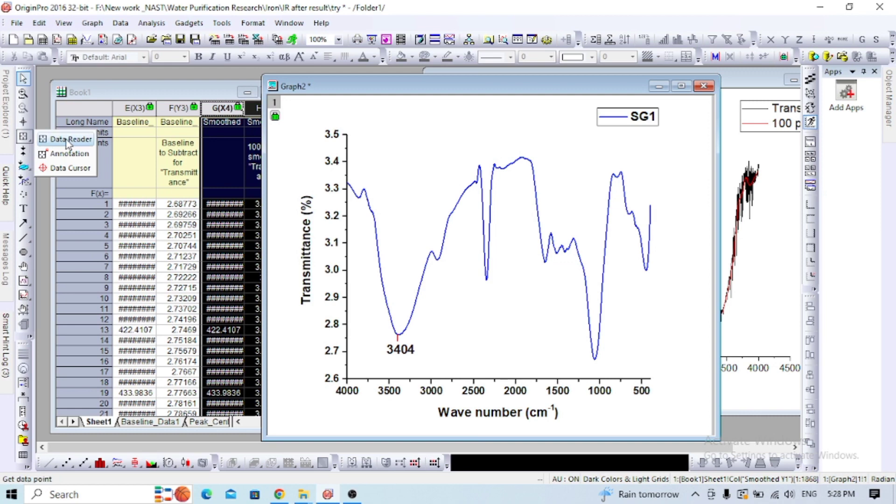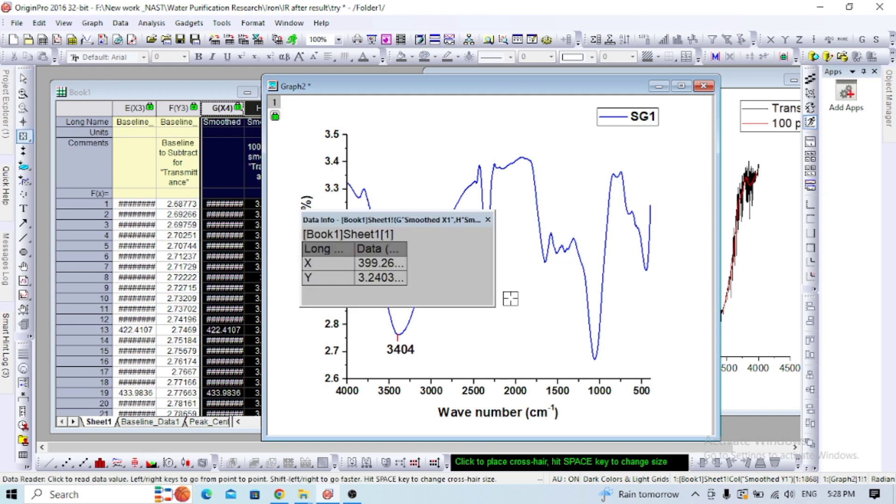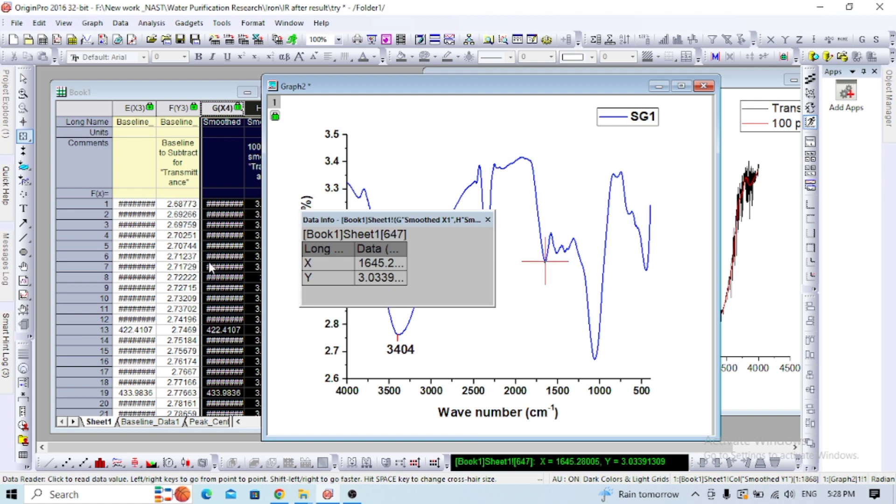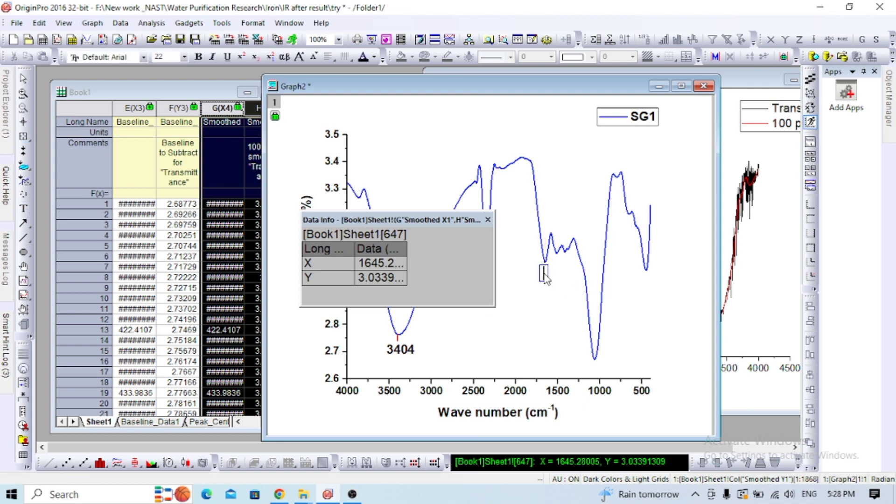For the next peak, use the data reader again. You can see 1645. Take the text file and add 1645.